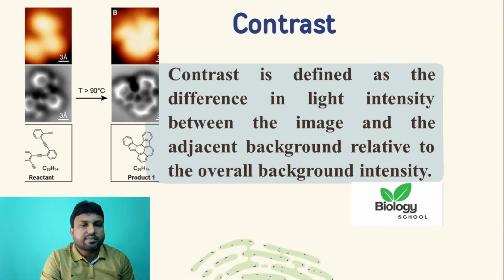Contrast is defined as the difference in light intensity between the image and the adjacent background relative to the overall background intensity. It describes the brightness difference between the light and dark areas of an image. Staining or labeling cell components are methods for enhancing contrast so they stand out visually, which is practiced in the laboratory to enhance the contrast of the specimen to observe it clearly.